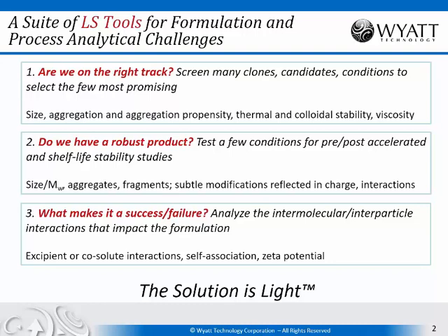For today, we're going to focus on high throughput aspects of screening, which are mostly relevant to phase number 1, which is looking at a large variety of candidates or conditions and selecting out those which are most promising to continue on to additional studies.